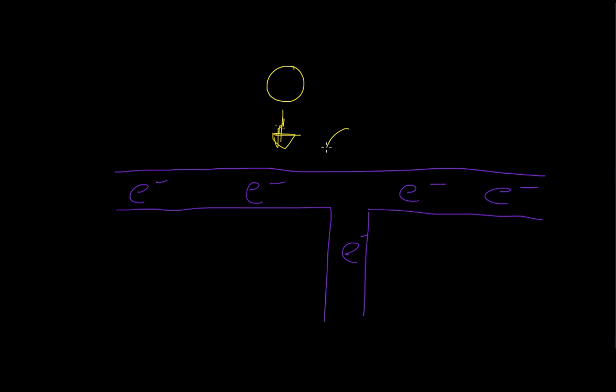Comes in, hits our wire, and an electron jumps from the wire, let's just make this positive, jumps from the wire onto our positive ion to then, if you imagine this is what happens, to then make this neutral again. So it's just basically remade our original molecule.